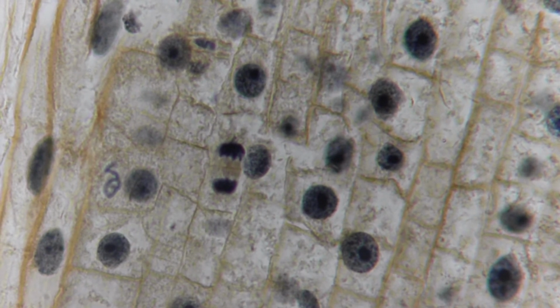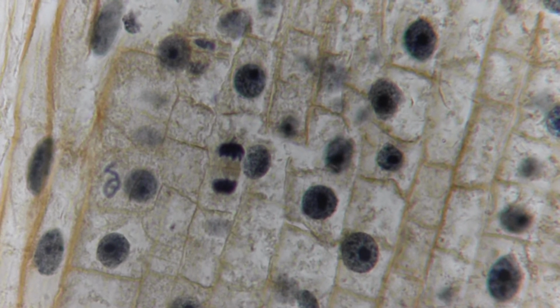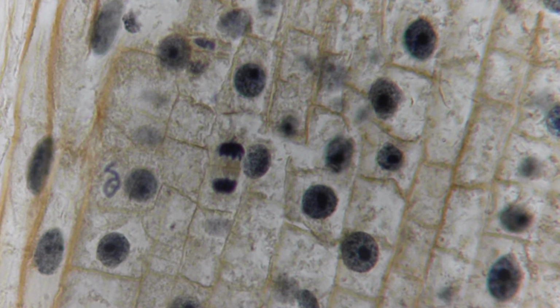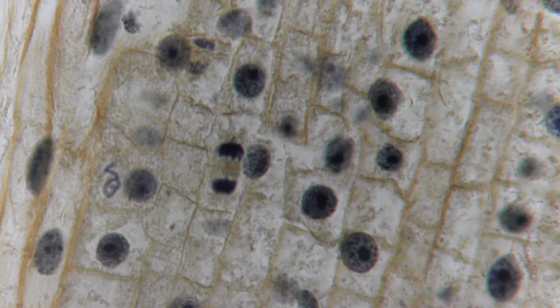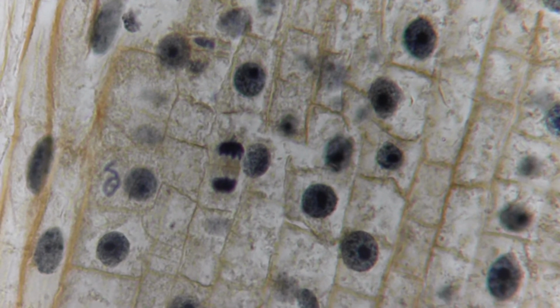So this is a picture-perfect telophase, but you're just going to have to draw that cell plate. So if on the practical you see one that looks like that with a horizontal line between those two masses of chromosomes, that will be the cell plate. It continues to grow until it goes all the way across, and it'll become the dividing cell wall between two daughter cells. So you go from telophase, and I showed you the daughter cells out of sequence a minute ago.